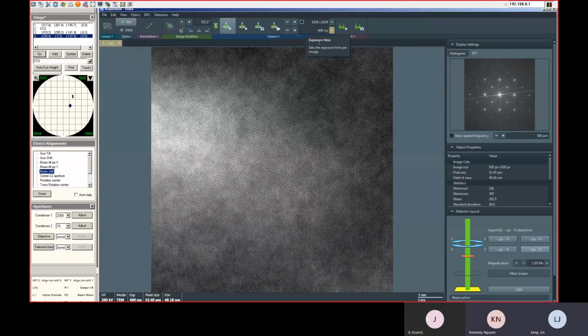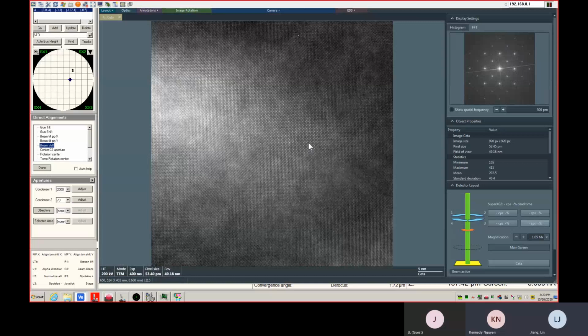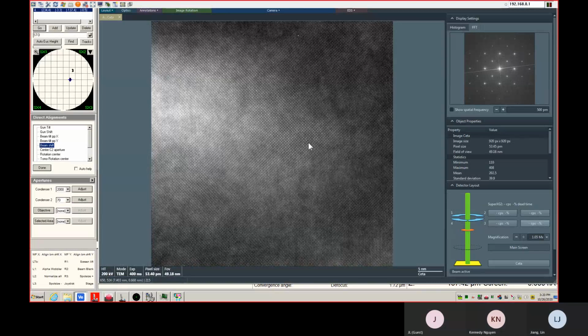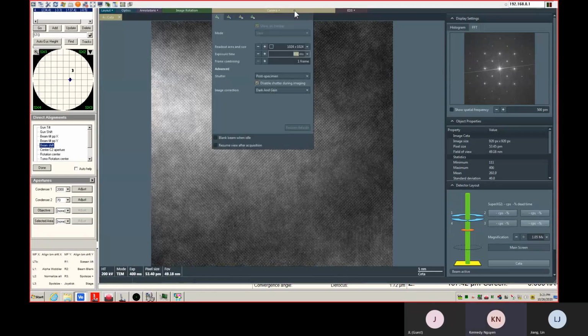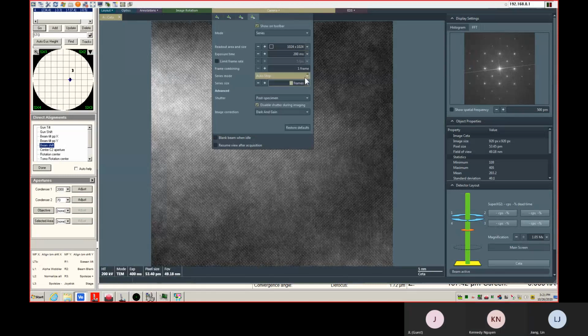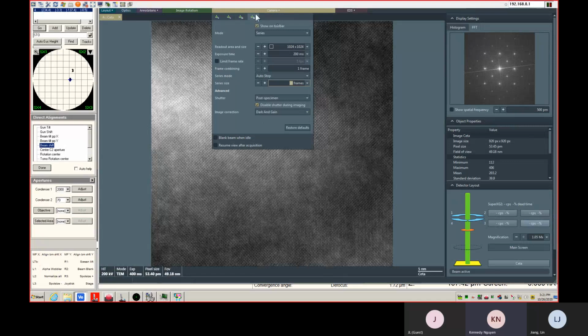Let's say this is a good region. Okay, so should we take a picture? Yeah, with the camera. We'll do the 10 frames.